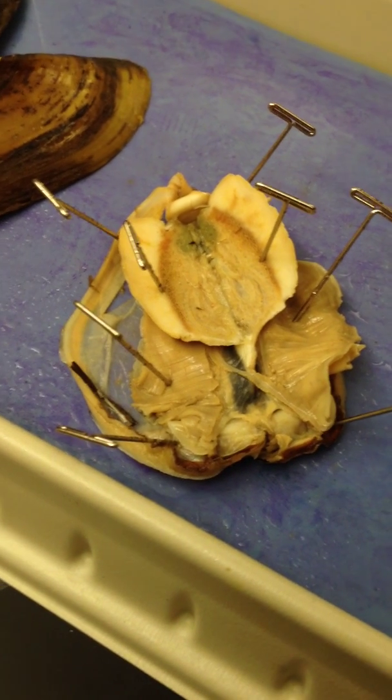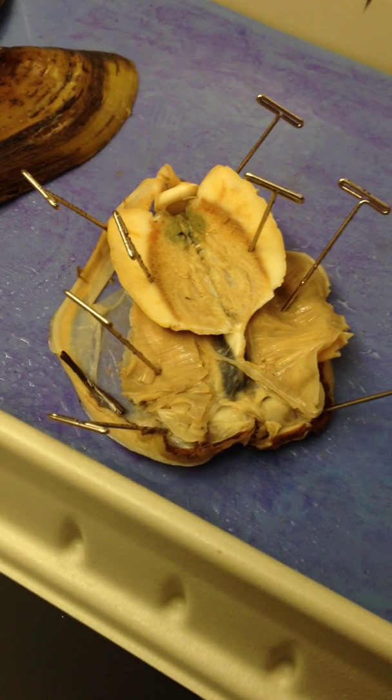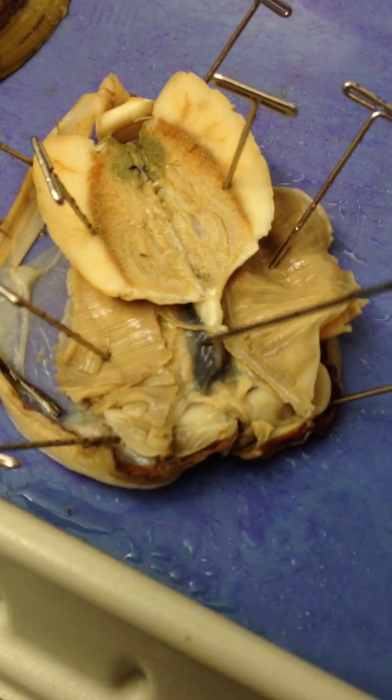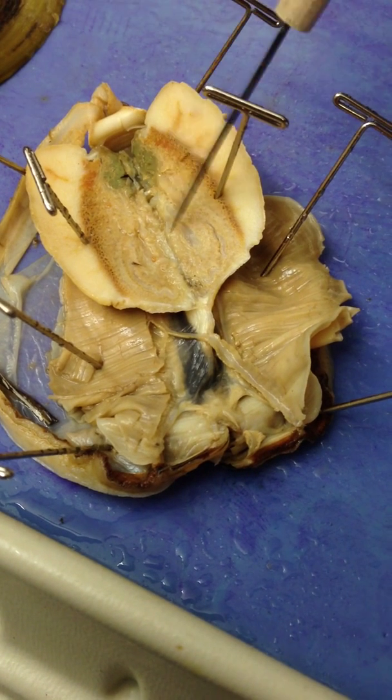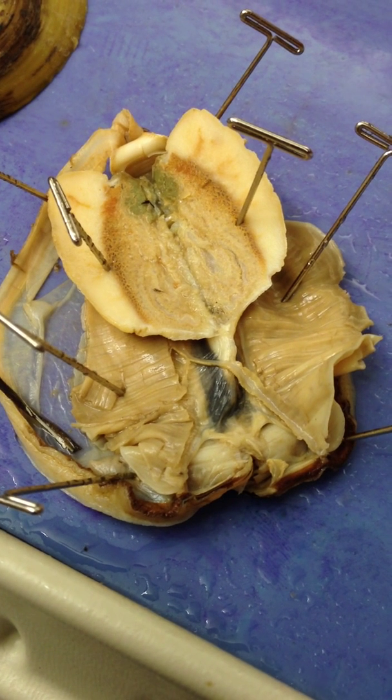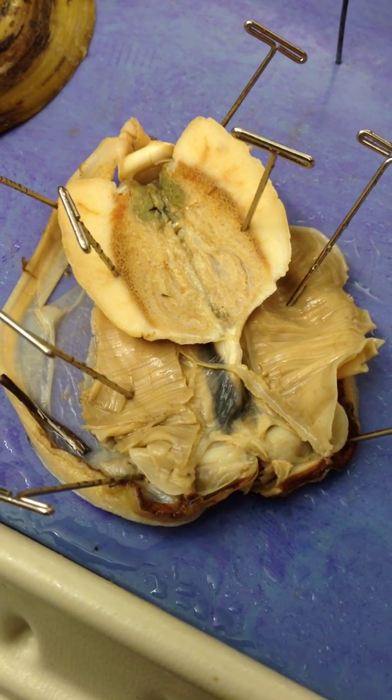The heart is on the back side — you can't see it now. The kidney is also back there, and it's this black mass that you can see right here. The heart would be around here, but on the dorsal side. That's it.